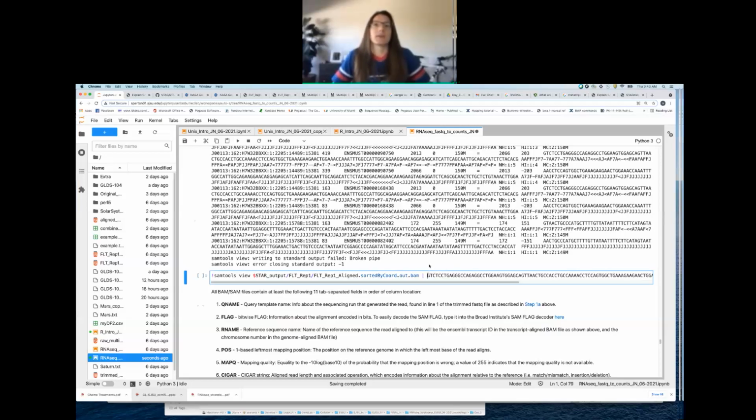And then we're going to pipe this into a function we haven't talked about yet, but this is another really useful function that I use all the time in Unix. It's called grep. And that allows you to pull out a string from your file, and not only will it pull out your string, it'll pull out the full line of where your string came from.